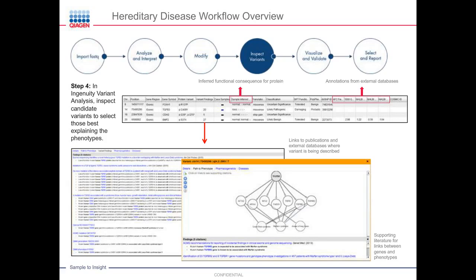So when you use this information, it can make this association, and therefore you can come down to really less than 10 variants in the end as candidates.